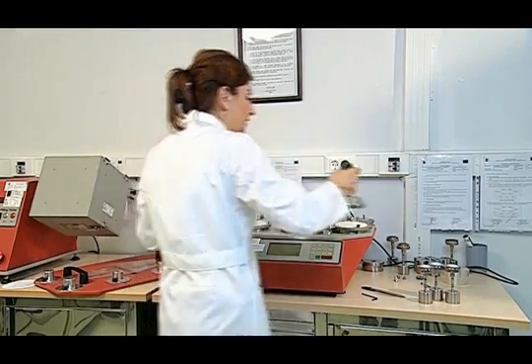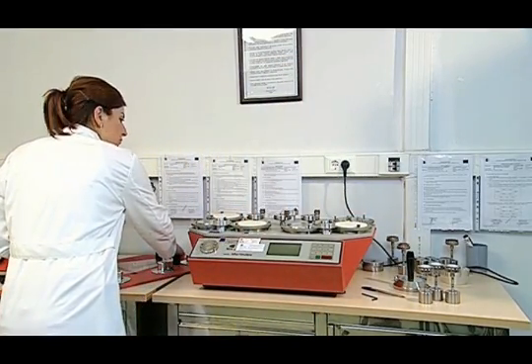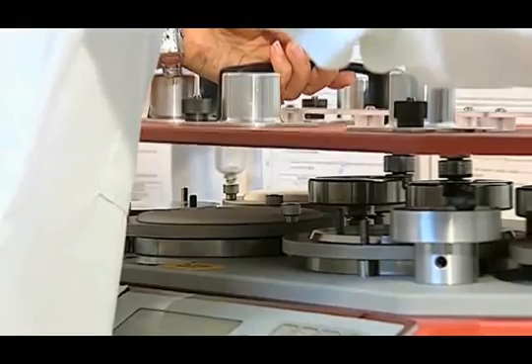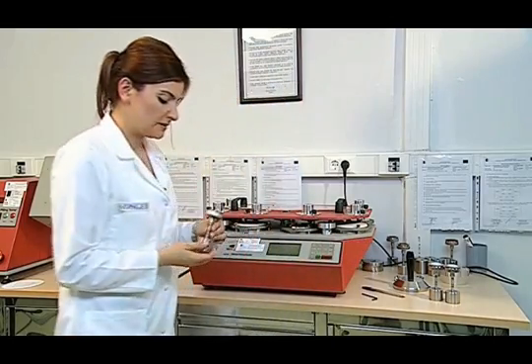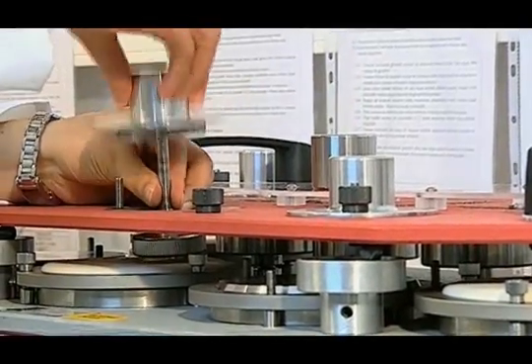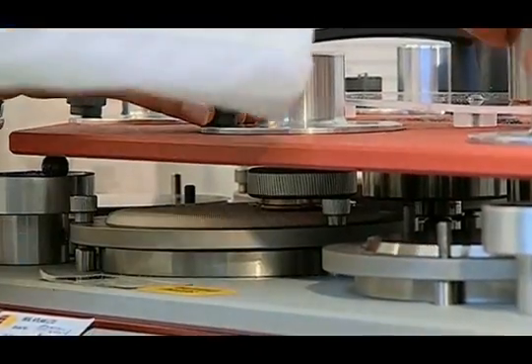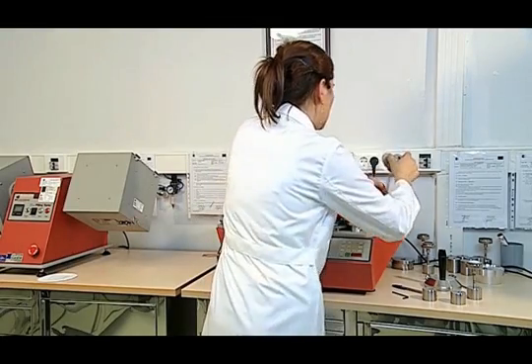Removing the 2.5 kg presser foot from the abrasive fabric, we insert the sample manually. We then place the samples on the tables with matching numbers in accordance with the number on the sample holder, and attach them with the compression apparatus. Checking the number of the second sample, we place it on the abrasive table as well.